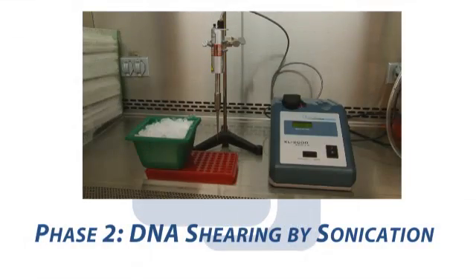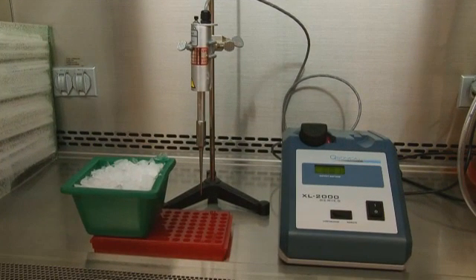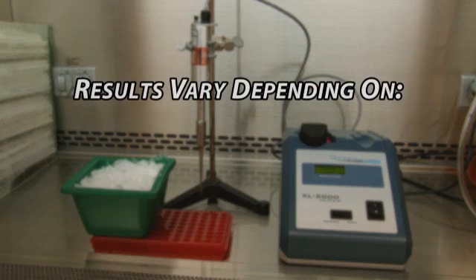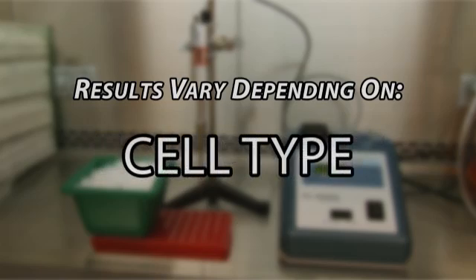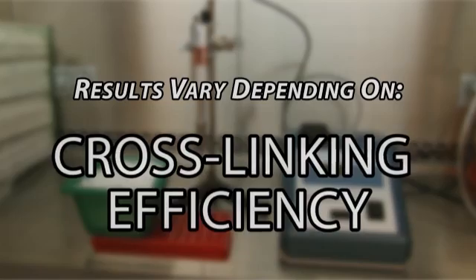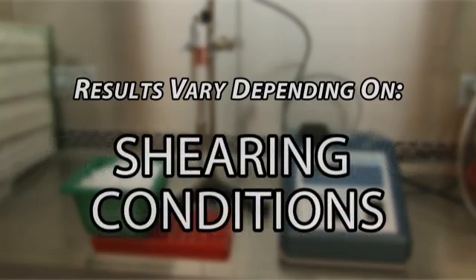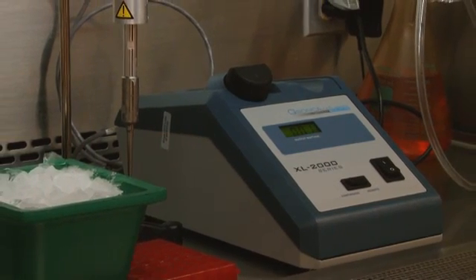In the second phase of ChIP, we will use a sonicator equipped with a microtip to shear our DNA to fragment sizes of 100 to 1000 base pairs. The conditions for shearing must be empirically derived and optimized before proceeding to any of the following phases. Results vary depending on your equipment, cell type, cell density, cross-linking efficiency, and shearing conditions.